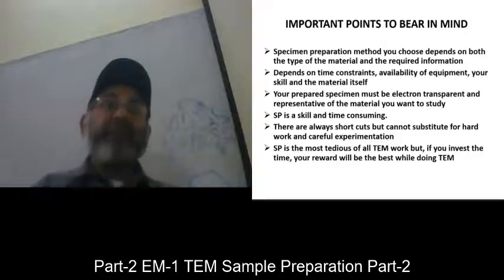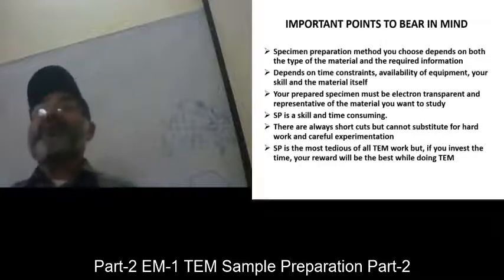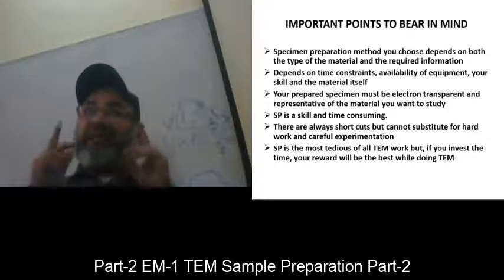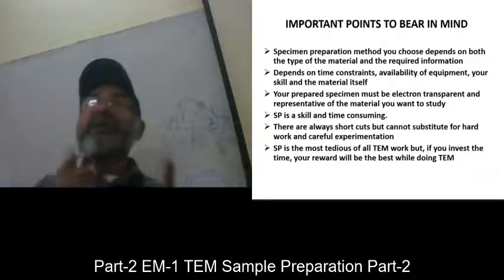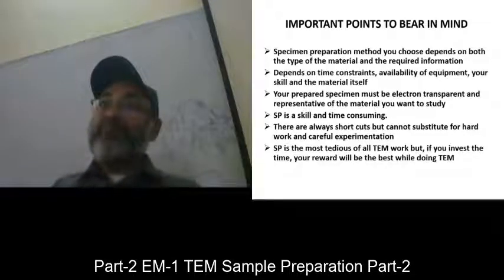The machine is telling you this, and you give the specification of the machine, the experimental conditions of the machine, everything is given, because the accuracy, the reliability, the authenticity of the information depends upon the information you give.